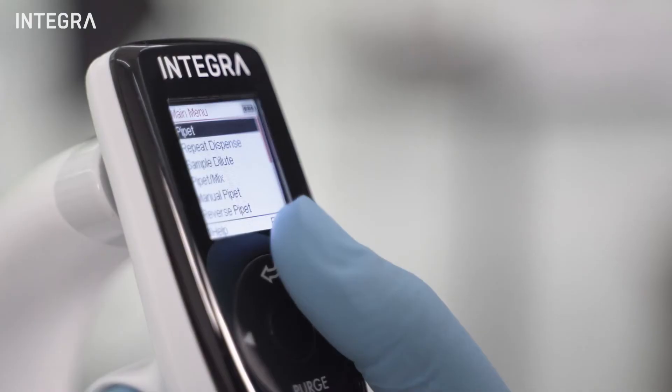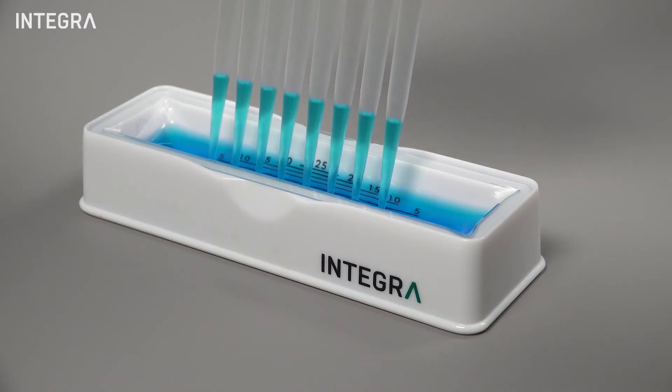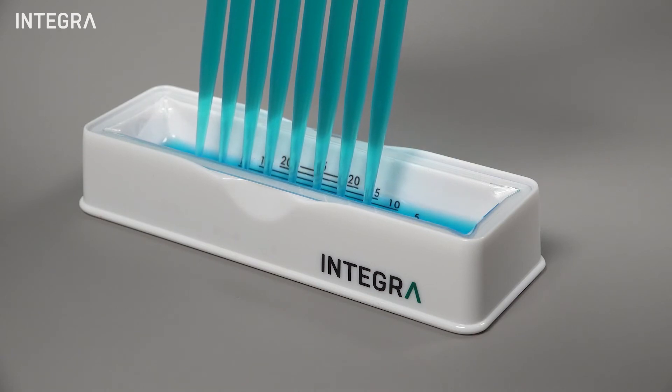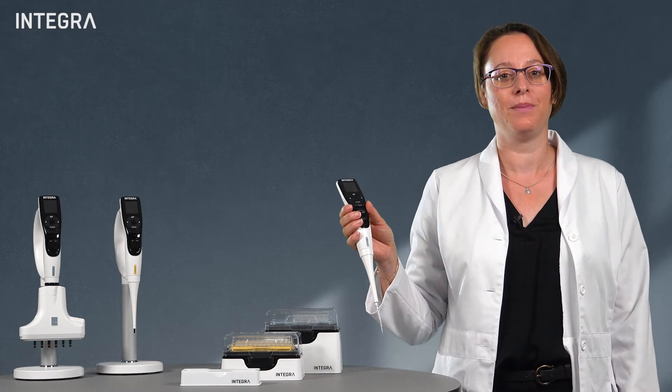Electronic pipets offer a bit more in terms of productivity, and precision values can often be better because the pipetting is controlled by a motor. Variables such as speed and volume are always the same between each dispense.